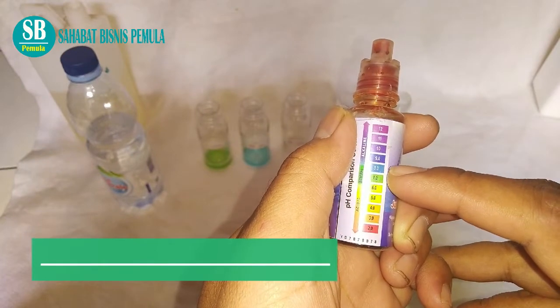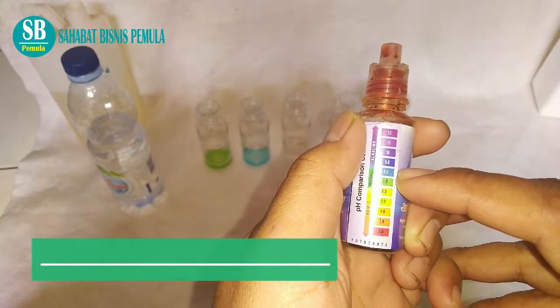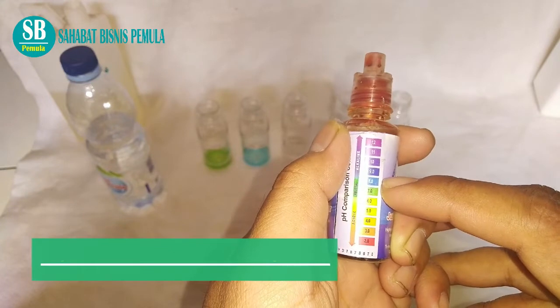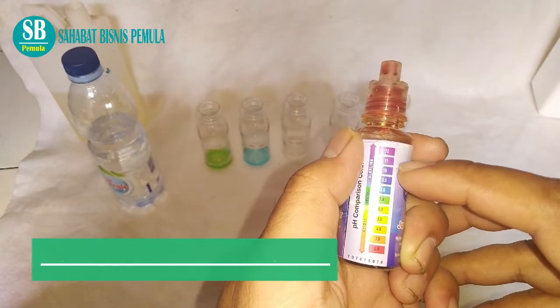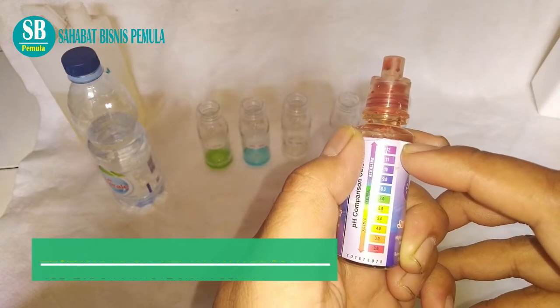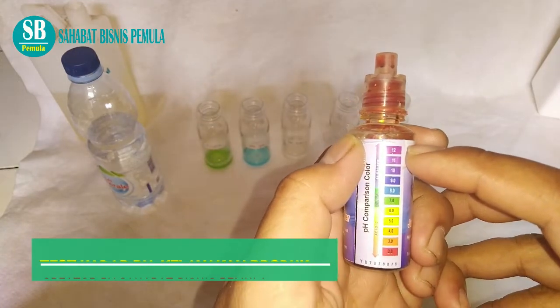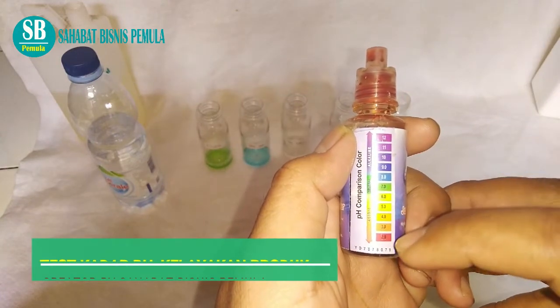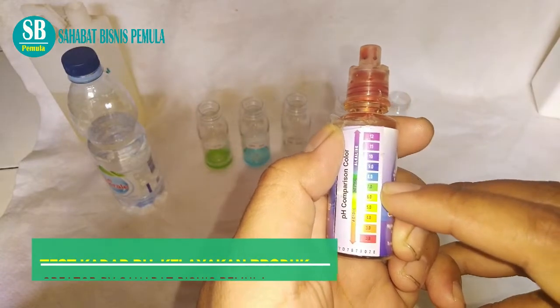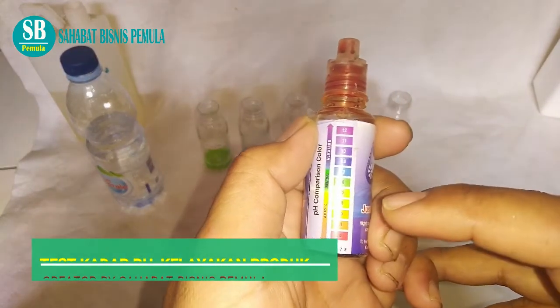Kalau pH-nya 7 atau 8 biasanya itu air minum. Air minum itu yang kadarnya rendah dan bagus. Tidak berbahaya. Kalau ukurannya 9-10 ke atas ini terlalu basah, maka kulit kita akan gatel-gatel. Jadi untuk ukuran pH ini sangat penting dalam pembuatan produk kita, layak atau tidaknya untuk digunakan.